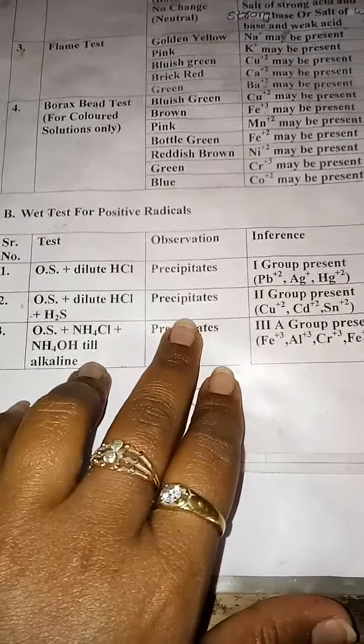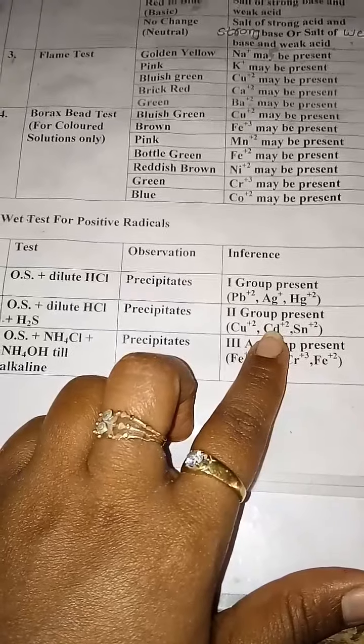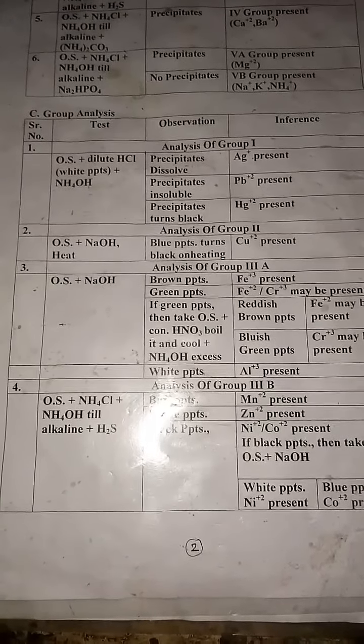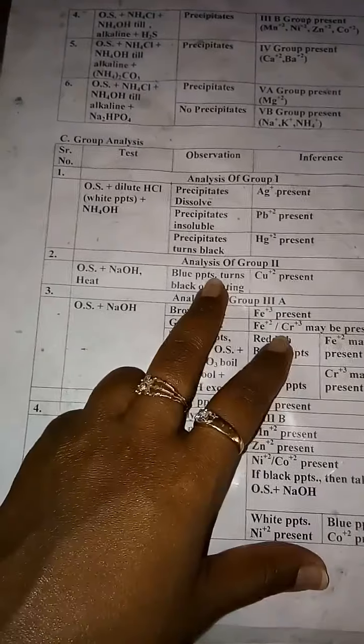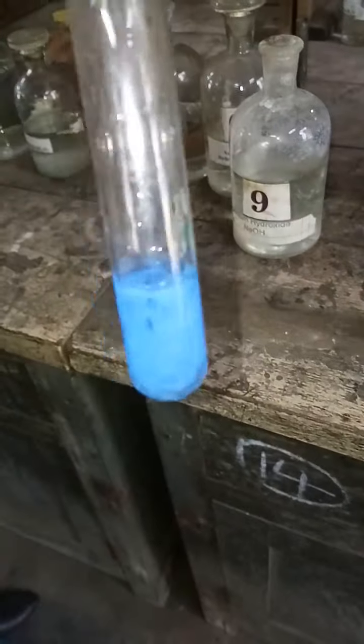Next we have Part B, the wet test for the positive radical. The first test is OS plus dilute HCl. I will take a small amount of OS in a test tube and add dilute HCl solution. You observe that you have a clear solution — it means no precipitates. So the observation is no precipitates, and the inference is that Group 1 is absent; Pb²⁺, Ag⁺, and Hg²⁺ are also absent.